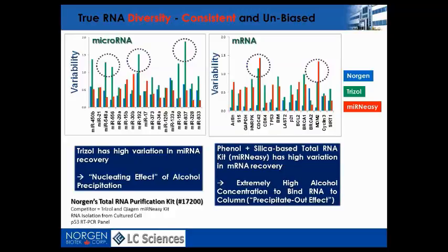This slide shows that silicon carbide was able to bind RNA sequences at an equal rate without bias and without the use of phenol, as opposed to a phenol-chloroform method coupled with a silica-based matrix. Most importantly, all RNA sizes, especially small RNA below 200 nucleotides, were also extracted. Therefore, we are not missing anything for our downstream application or microRNA expression profiling.